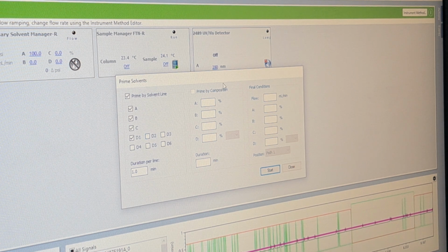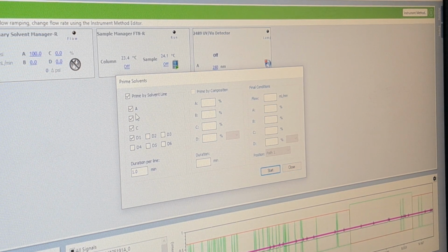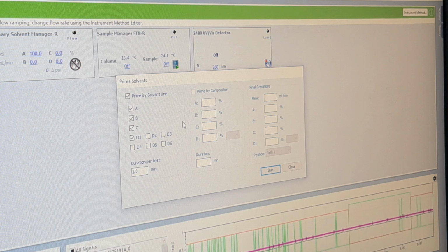Channels means he is asking, I think, about wiring and all this, so you have to put an extra bottle for that? No, nothing. We have only 4 default channels. Which are those? A, B, C, D. Yes, A, B, C, D.